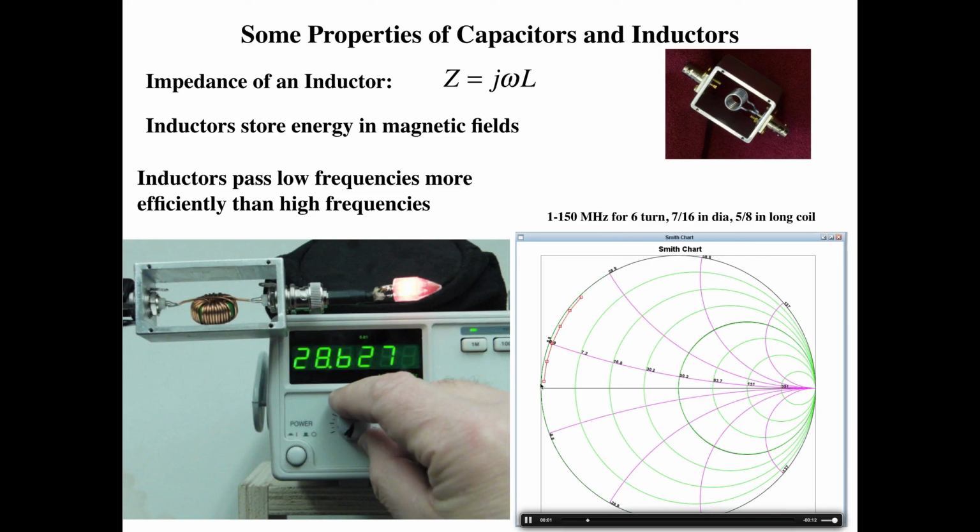Okay, so our 1 megahertz point is over here at low impedance. Keep increasing the frequency, and it wraps around the upper half of the Smith chart until it starts approaching very high impedance. So at low frequency it was low impedance. Increased the frequency, it went to high impedance. And again, this illustrates why we had earlier labeled the upper half of the Smith chart as being inductive.